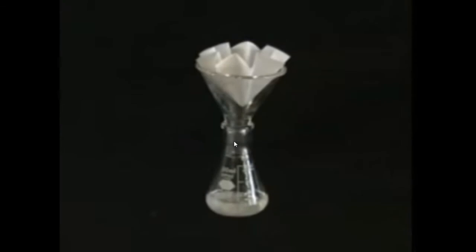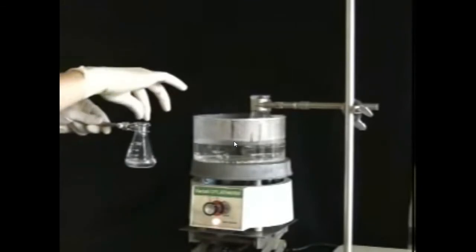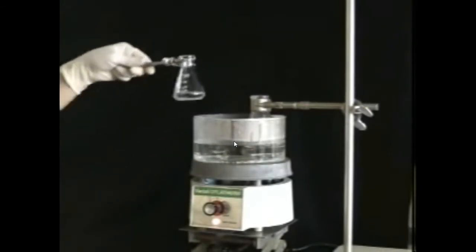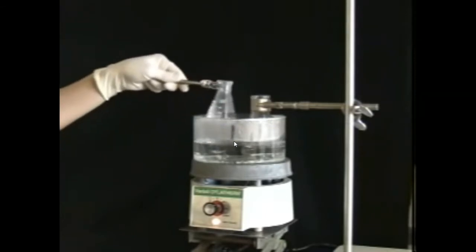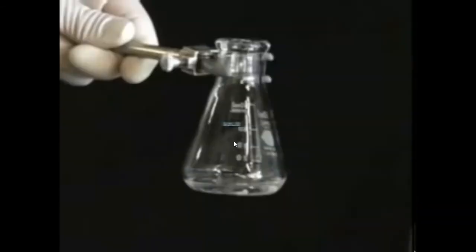Crystals frequently form in the filtrate during the filtration, but they easily redissolve with heating. Caution: your compound is no longer dissolved in a minimum amount of solvent. Before proceeding to the next step, you need to boil away the excess solvent. Remember to add a few boiling stones to the solution and boil until solid begins to form.